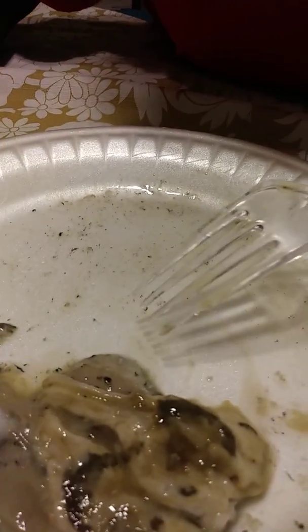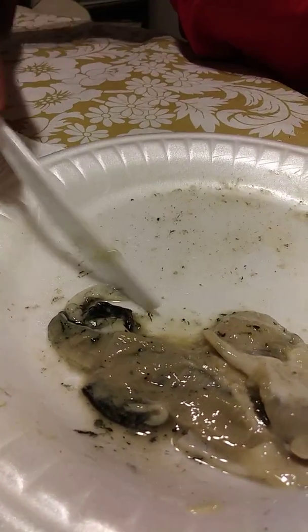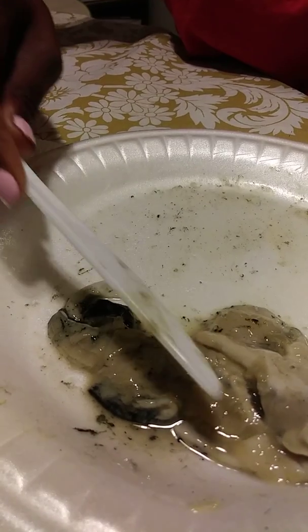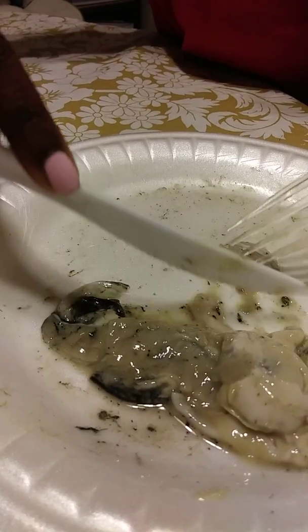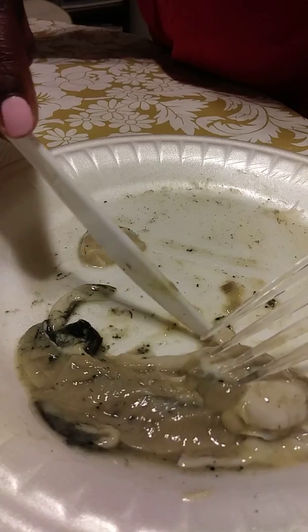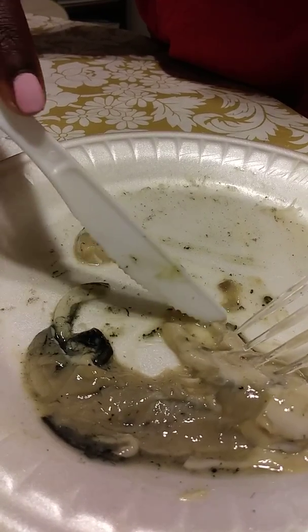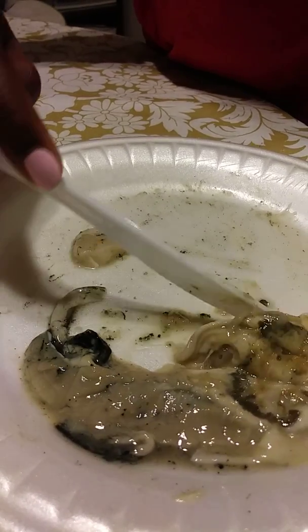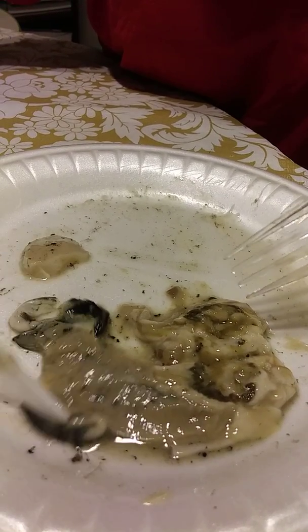And that's the mantle muscle responsible for opening the shell. Flip this part over and we see the heart once again. So just so we can differentiate organs, I'm going to cut off the heart and move it over here. The heart is gone now. So now we see the intestinal tract in the anus. Flip it back open so we can see the stomach again and the tract of the intestines. And these are the little tentacles.